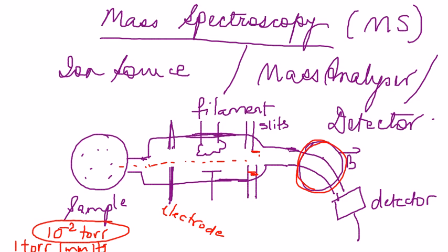So the accelerated ions are going to go through, and then depending on the mass and how focused or unfocused they are, they could either just fly away essentially, or they would be focused and then go to the detector, and that is the peak, the ion that will be detected by your detector. This detection is basically done electronically. That means there is a computer hooked up, which will analyze and store the data.